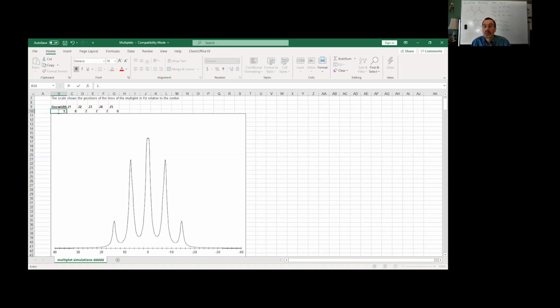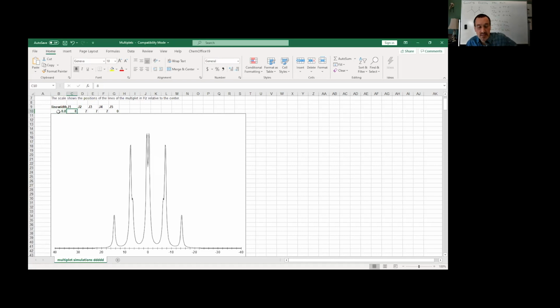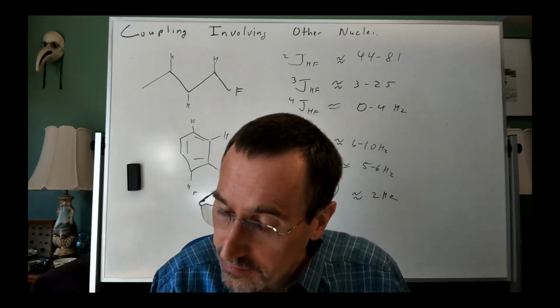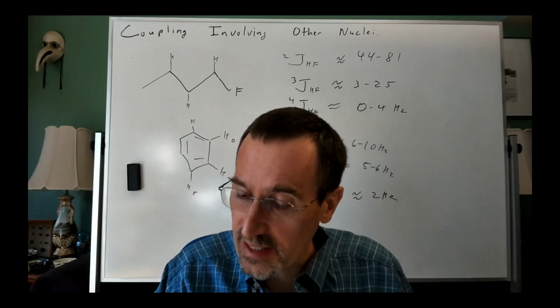You probably wouldn't see things resolved at all. And if they were a little sharper, maybe you can put in 0.8, you'd see them better resolved here. So that really reflects the limits of both the spectrometer and the physics of the uncertainty principle. Other thoughts on this?